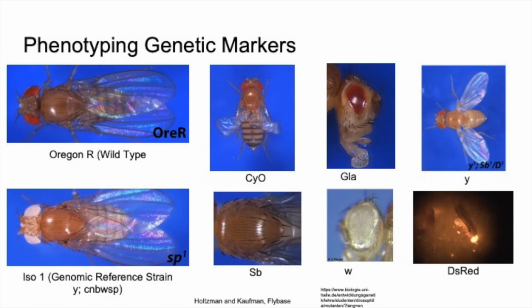You can phenotype all of the other visible genetic markers the same way you would phenotype sex. Spread the flies out into a thin line on the flow pad, then use the paintbrush to separate the flies that have the phenotype you're interested in from the other flies. Place the flies you want into new vials and dispose of the other flies into the morgue.